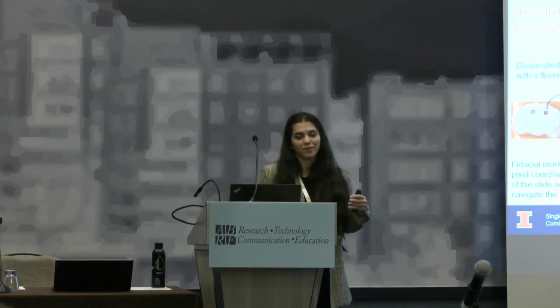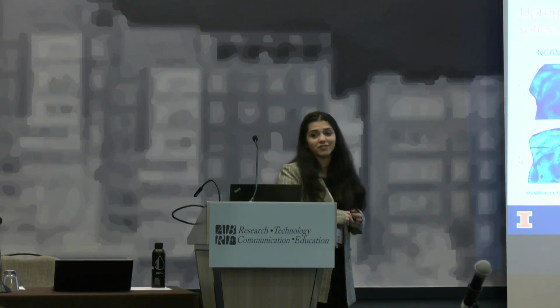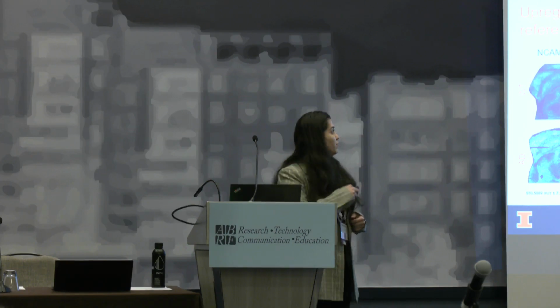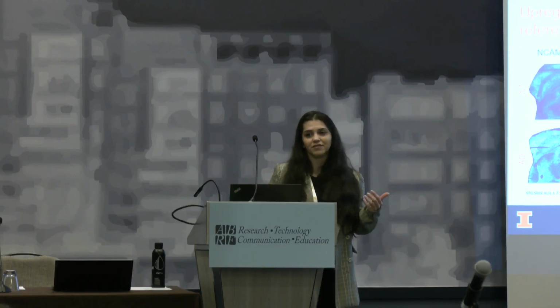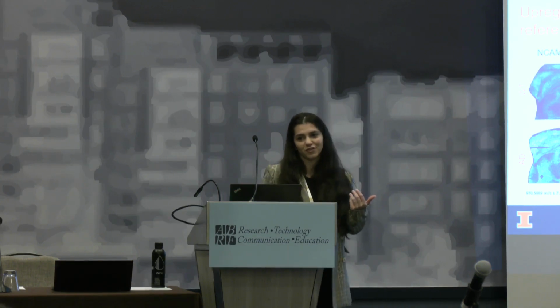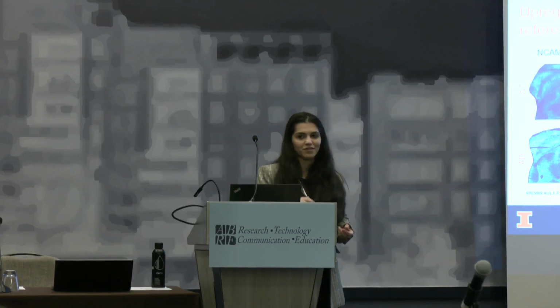Here, if I show you half of this, it comes from the matrix. This is one of our biggest problems: the matrix can cause a low signal to noise ratio. You do see a lot of its peaks, but with the mass tags, I go in knowing what to expect and what I'm looking for, so I know which peaks to look for. But with the lipids, you do have to do further analysis. You can do MS/MS fragmentation. You can run standards and calibration. And there's also LIPID MAPS, which is a huge computational and LC-MS database that you can go from.